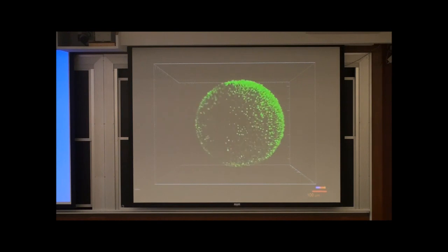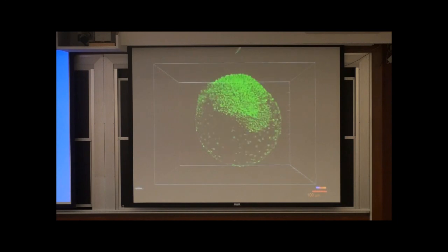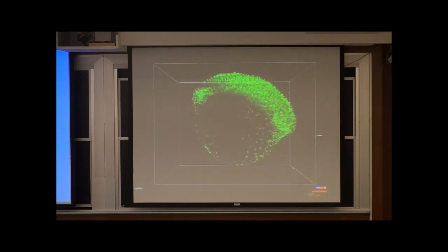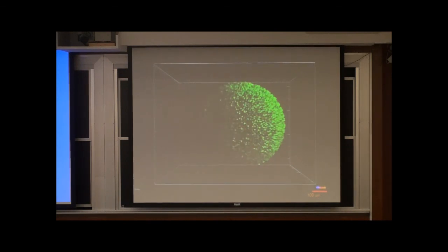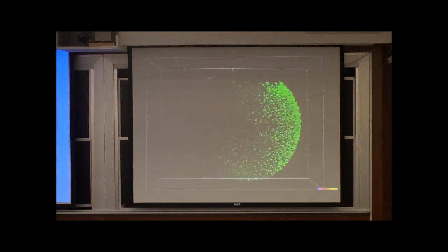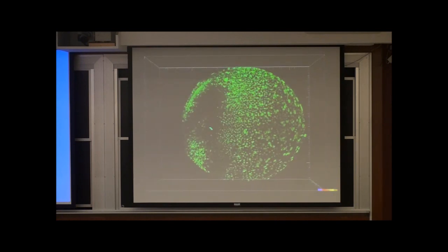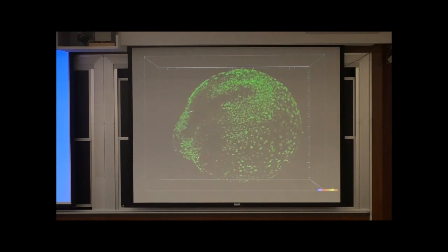These are single cells labeled with histone GFP, and it forms the gastrulation, and it forms the neuronal tube. You can see the eye formation in this part. This is the eye socket formation, and this is the neuronal tube formation. So I can see this whole process with single cell resolution. Similarly, you can take another view on the other side. You can see all the single cells. These are moving. It forms the blastulation, gastrulation, and then it is forming the neuronal tube in this part.